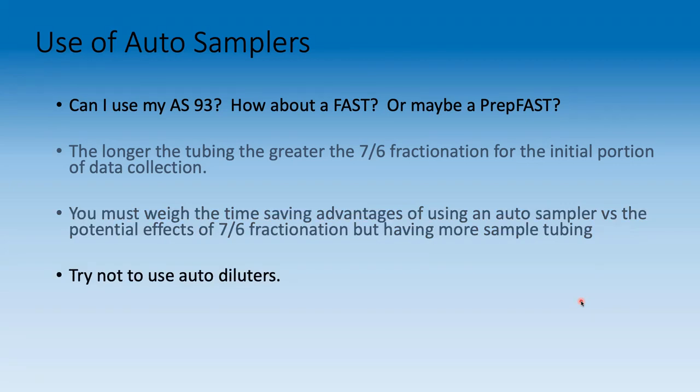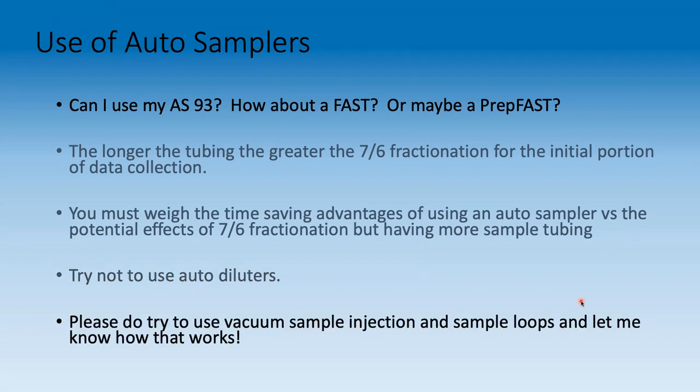I would not use the auto diluter if you have one. I would make sure that you make all your sample solutions and samples up by hand, at least initially. If one wants to go out and try and use vacuum sample injection and different sample loops, I encourage you to go do that. Please do, and let me know how that works.